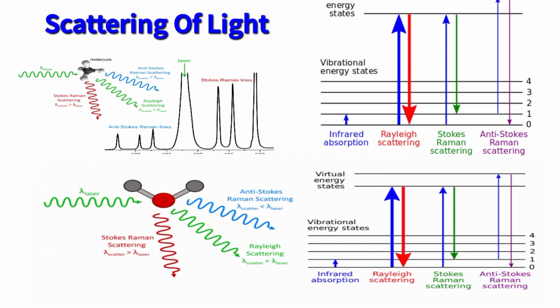Among all of these, Sir C.V. Raman observed that some molecules show a different type of scattering effect. That is, when radiation is incident on a molecule, it shows emission of energy lower and higher than the incident radiation. This behavior of a molecule absorbing or losing energy with radiation is known as Raman spectroscopy, Raman effect or Raman scattering.